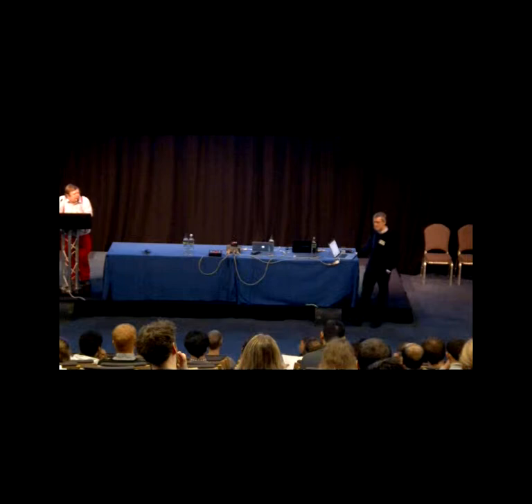I mean, is that because of the sort of particle identification? Because once you've identified them, it presumably wouldn't matter so much. I think for ab initio determination, you probably need to have a larger size. Probably once you have some reference information, you could use that information to search on your micrographs for particles. Yeah.